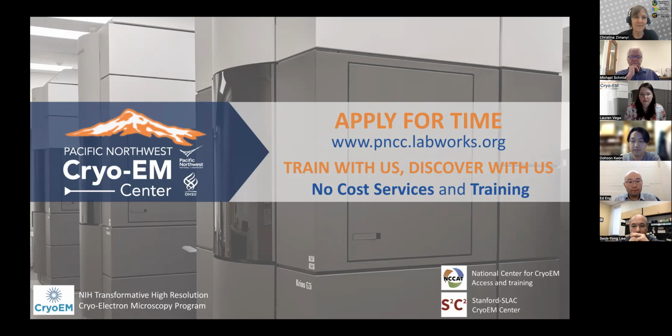So for microscopes, we have 5 of them. We have an Arctica with K3, 4 Krioses with K3 and Falcon 3. 3 of our Krioses are equipped with energy filters, and 3 have also been upgraded to fringe-free imaging. And then for sample preparation, we have a Vitrobot, a Leica GP2, and a VitroJet, which is unfortunately still undergoing validations before being offered to users.